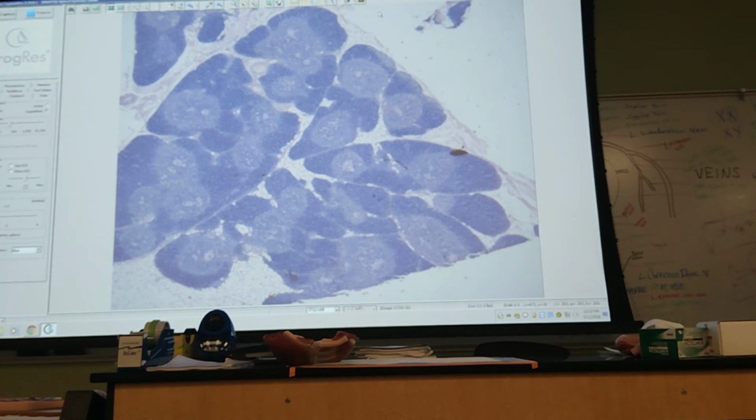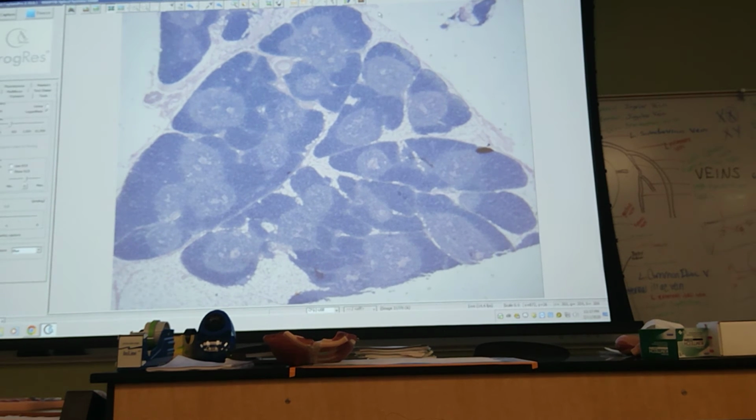Okay, here's the thymus. Just to remind you, where's your thymus hiding? Behind your sternum. It has a capsule on the outside. Capsules often show a lot of adipose, which sometimes accumulates there. The capsule has extensions, trabeculae, and these are very obvious in the thymus.